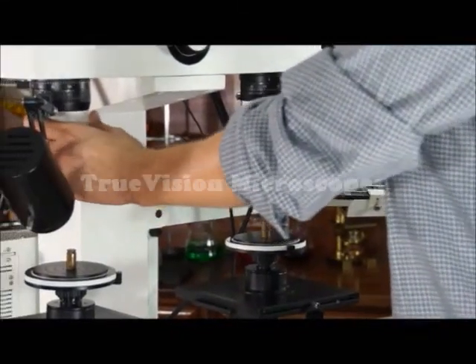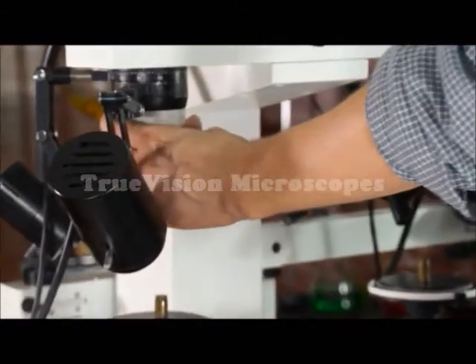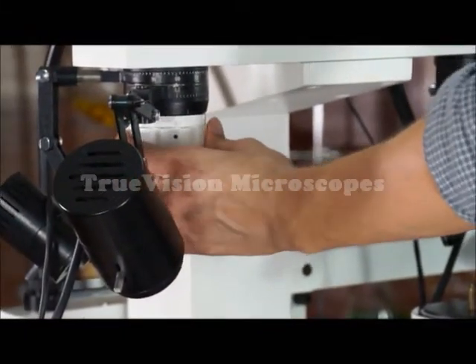Looking at the zoom, you simply turn the knobs to adjust the magnification.